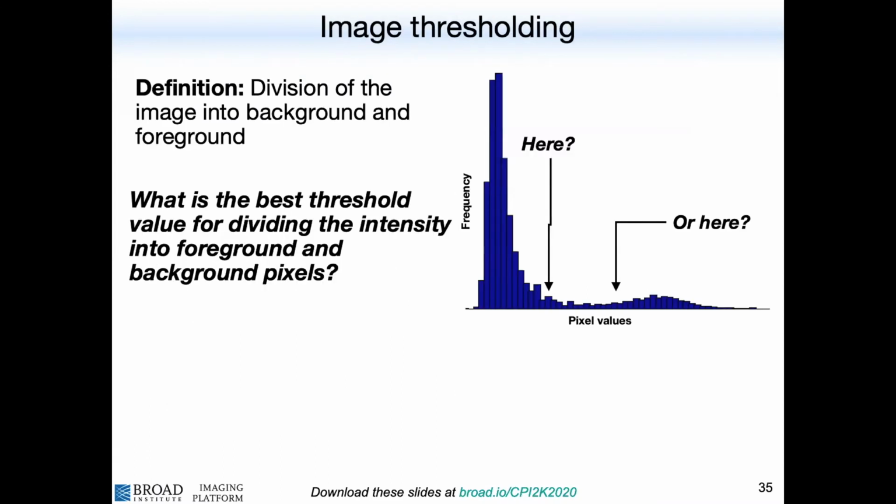One of the important features to define here is thresholding. For almost any thresholding algorithm out there, we look at the intensity histogram that I showed you earlier for an image. And that's basically what CellProfiler does. It looks at the intensity histogram for every individual image as it goes through the pipeline.